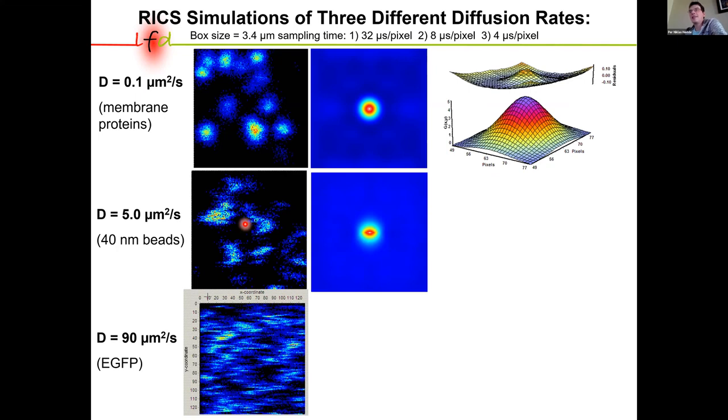If we calculate the correlation function, you will see this. It will manifest itself as a compression of the function between lines and an elongation between pixels. So the reason this is happening is now that the molecules can move, you have a higher probability to find them in pixels further away while you're scanning the line.